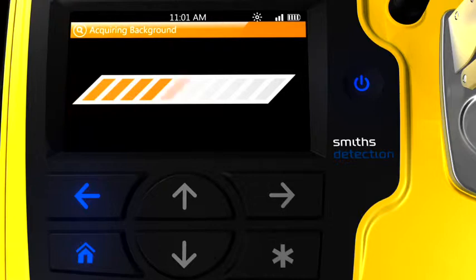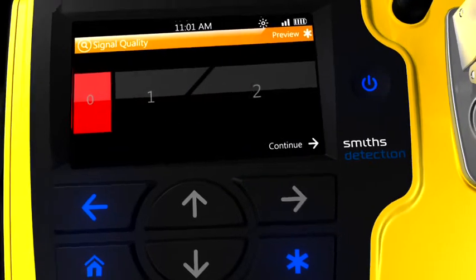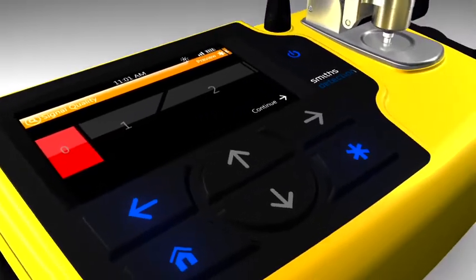During this acquisition, specific system parameters are being collected, such as the internal temperature and signal-to-noise levels, and these parameters get fed into the library search process to optimize the chemical identification results. Once the baseline reading is complete, the user sees a signal quality meter that will increase as the sample is loaded onto the Diamond ATR sensor.